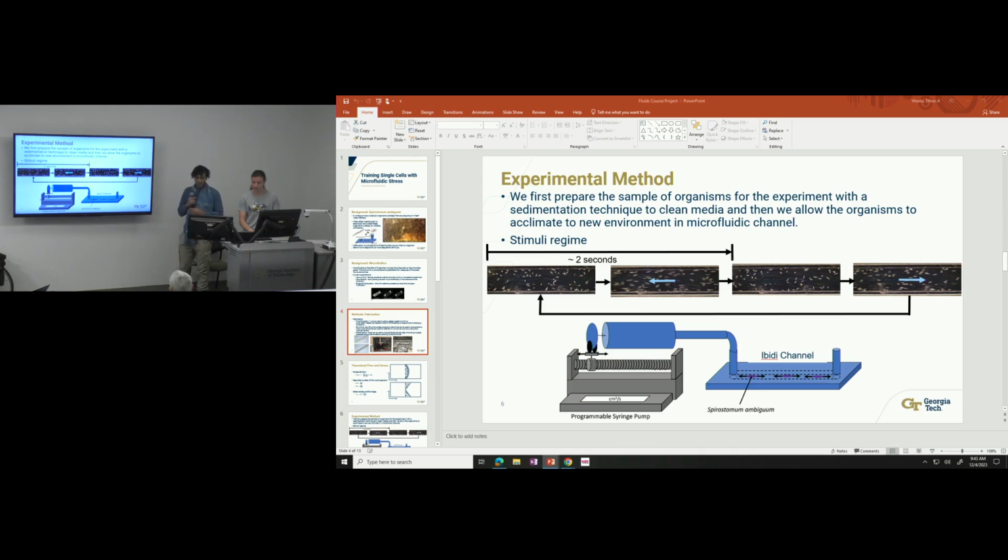But as Ethan pointed out, we were troubleshooting, and ideally it would be great if during the uniform flow, they would respond with the contraction. But I found there was a very low percentage of them responding, and they mainly contracted at the end, when I stopped the flow, which makes sense because I think at that point there's a lot higher change in the velocity gradients than in the uniform direction, and I think that would cause a higher shear. But these are all just our hypotheses right now.